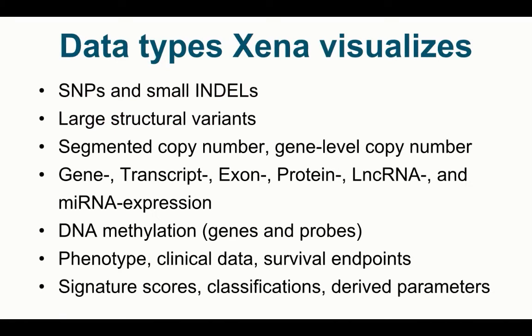What types of data does Xena visualize? Virtually every type of functional genomic data. We visualize mutations, structural variants, copy number data, a wide variety of expression types, methylation, phenotype and clinical data, including survival data, signatures, and other classifications.